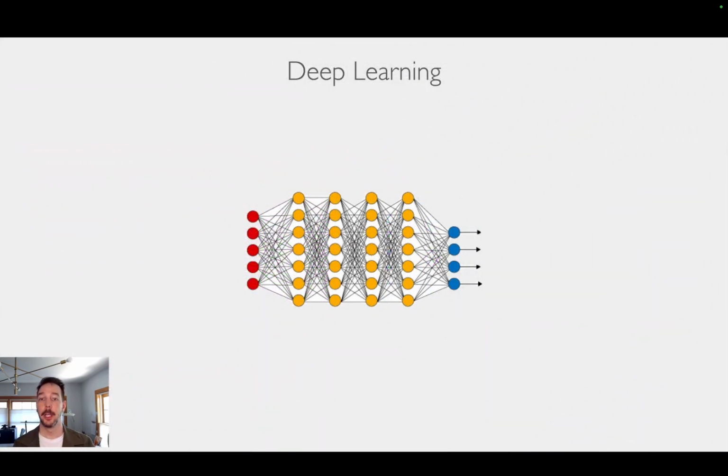Okay, so how do these deep learning models work? I know there's a varied experience in the background, so I want to keep this quite simple, but hopefully in a way that you understand what is happening to use these networks for your own research. The way we're solving these problems is by creating an architecture of neurons in varying amounts of layers and in varying numbers to solve problems by learning what is the correct response, and gradually refining their weights to give us the answer that we're looking for.